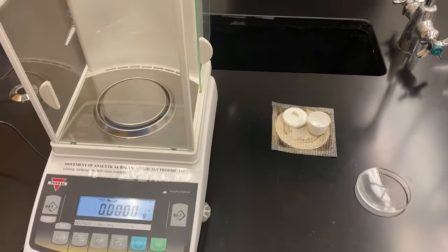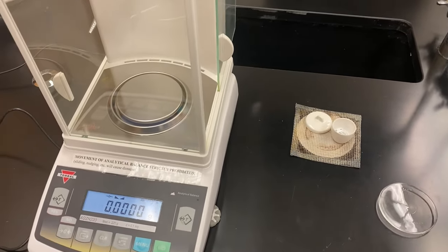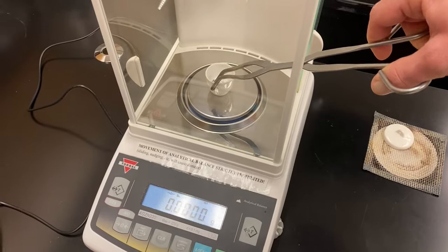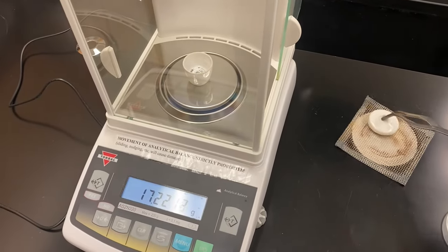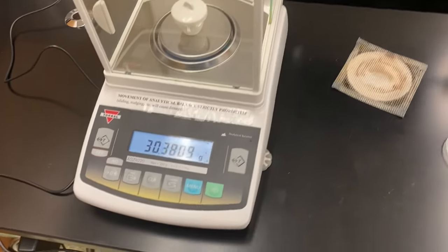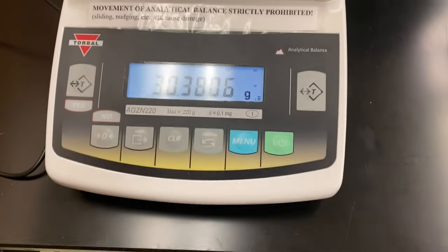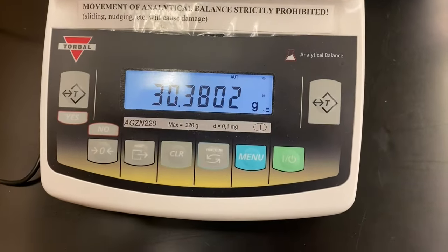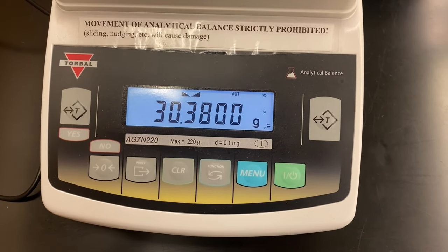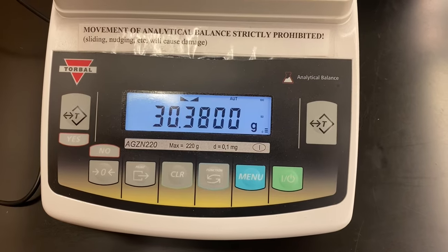I pulled my sample from the desiccator and we're ready to take the final mass. I'll put it on the balance — we also want the lid because we had that at the beginning — and wait for it to reach balance. There's our final mass.